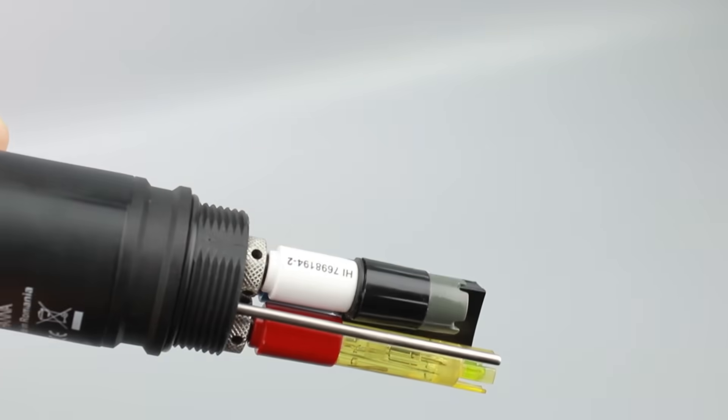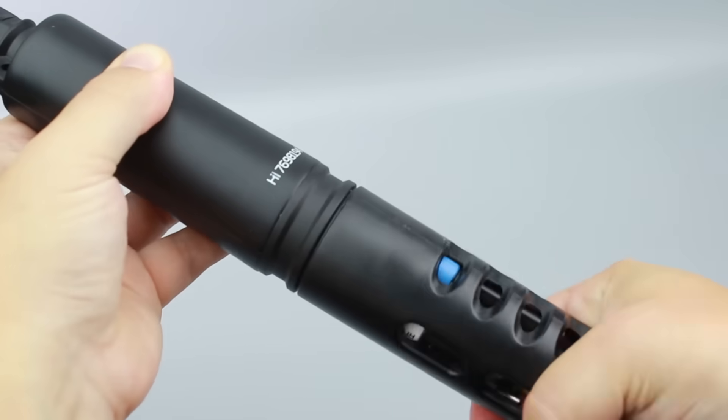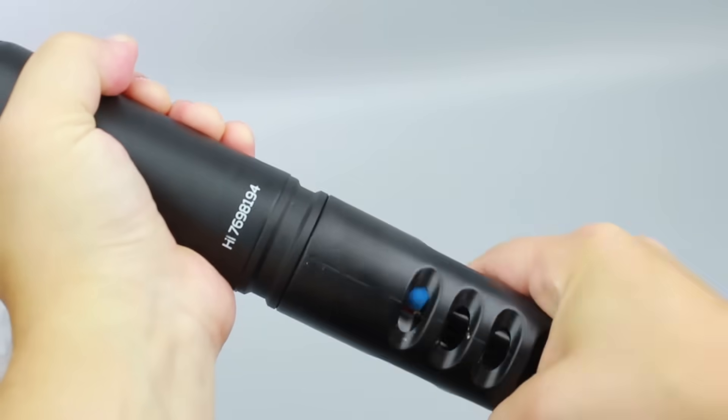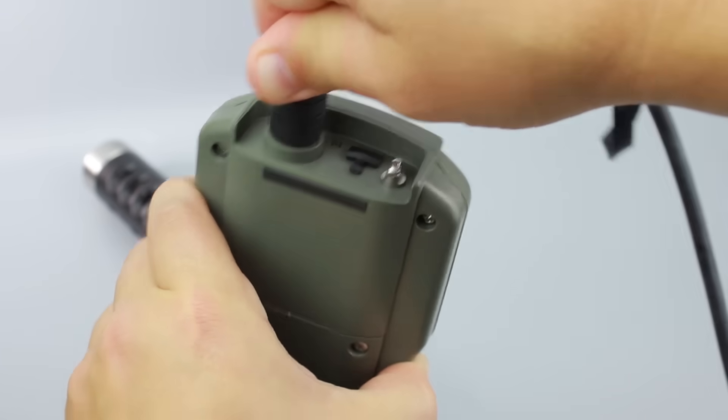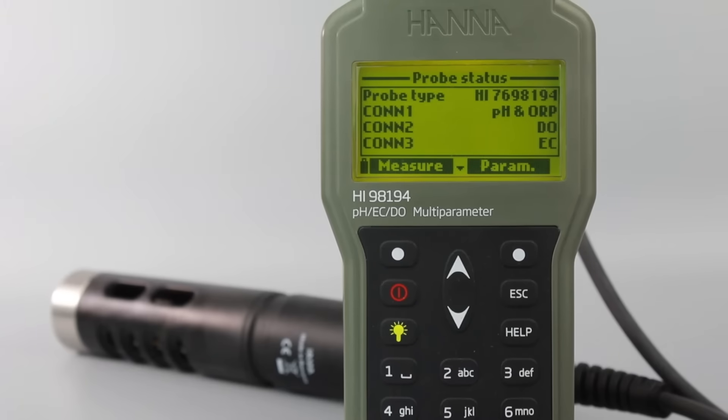Once complete, screw the protective shield onto the probe body — this will help protect the sensors. With the meter off, connect the probe to the input on the top of the meter. Turning the meter on, it will automatically recognize the probe and the installed sensors and identify them on the probe status screen.